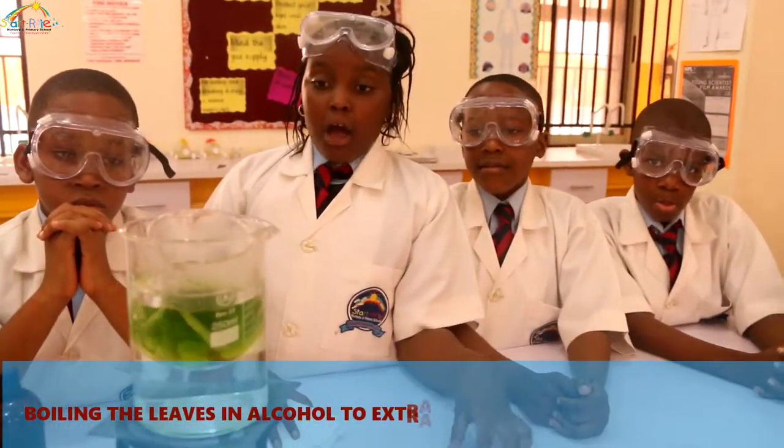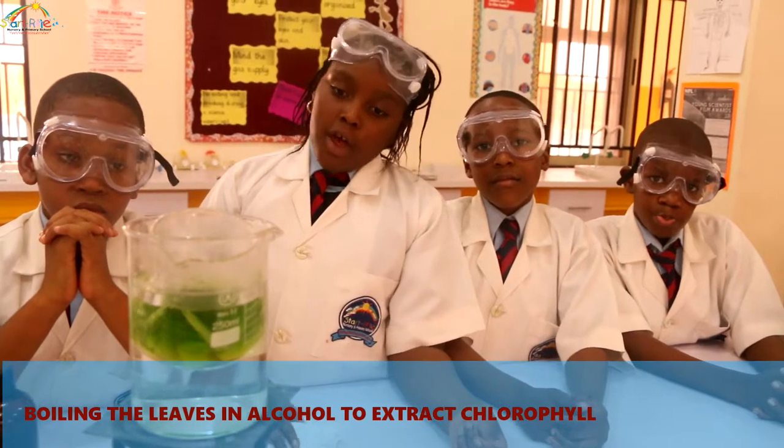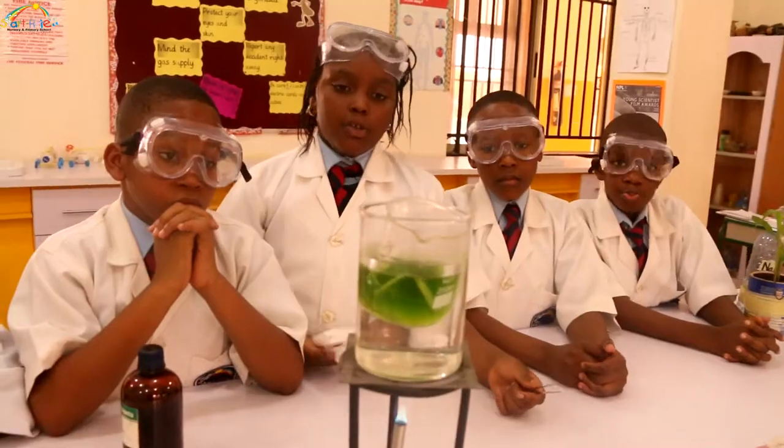As you can see, the alcohol has changed colour and the leaves have been burned. The alcohol has changed colour, which means that chlorophyll has been extracted from the leaves.